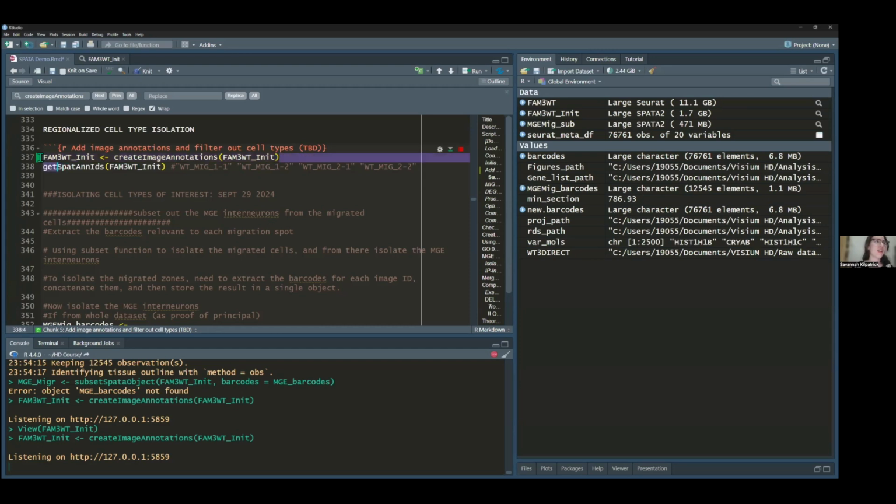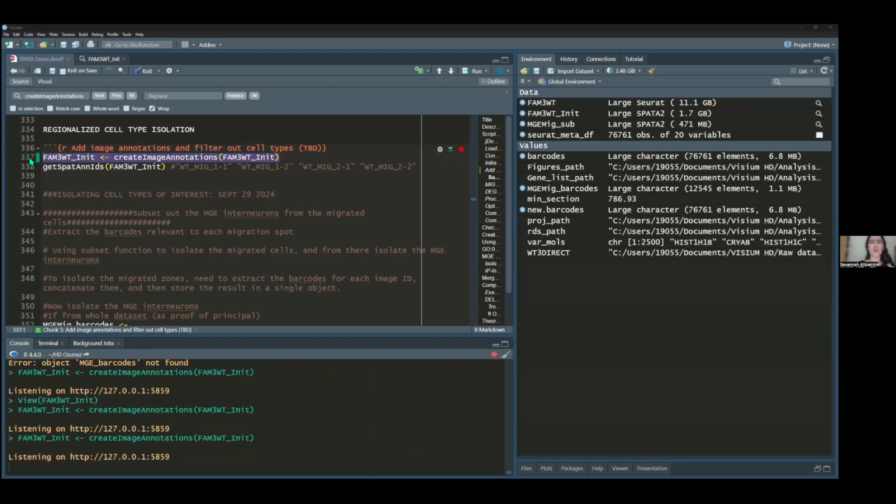And then can you also see, oh shoot, let me just, okay, so you can see the RStudio. Can you see the pop-up? No, we can't see the pop-up. Okay, good to know. I will just share the pop-up screen.